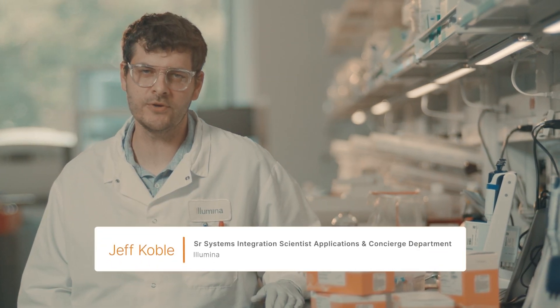Hi, I'm Jeff Koble, and today we are going to be reviewing the Illumina microbial amplicon prep protocol.